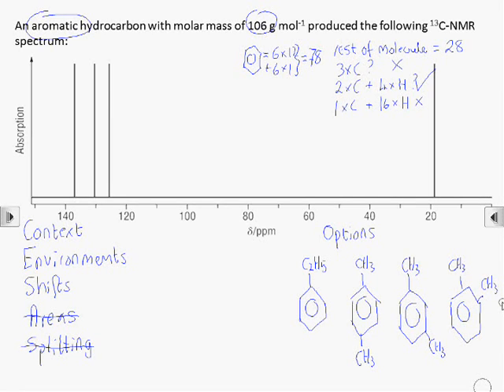Now, we can use the carbon-13 NMR to help us select between these, starting with the chemical shift and the number of environments. So we've got four different peaks, so four different carbon environments.